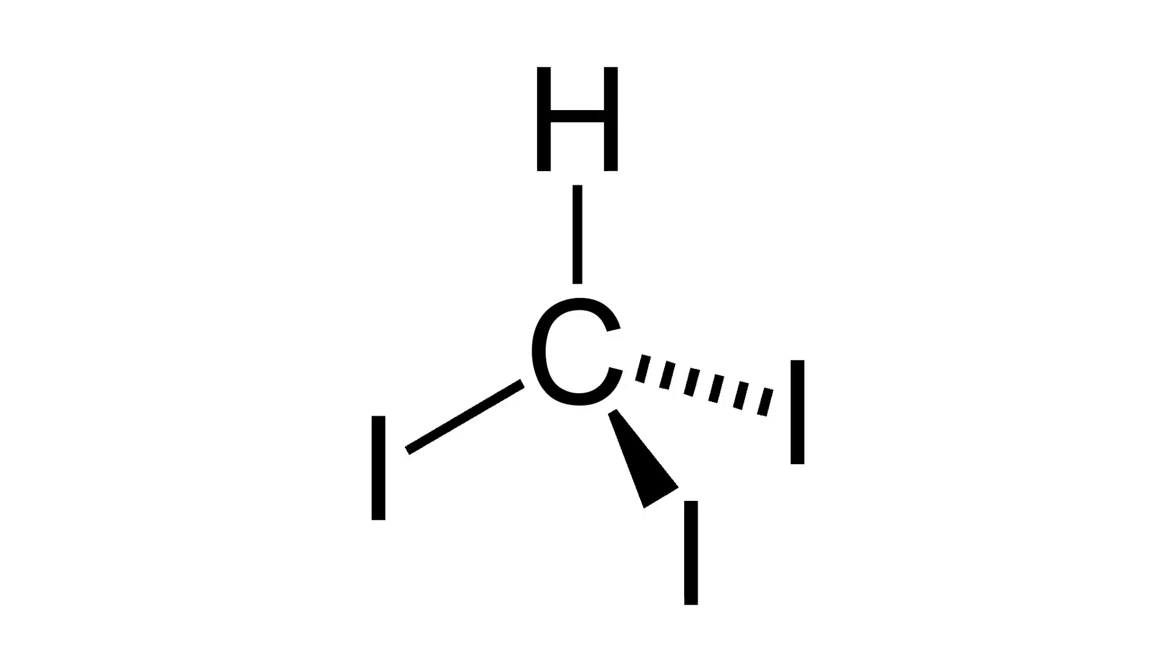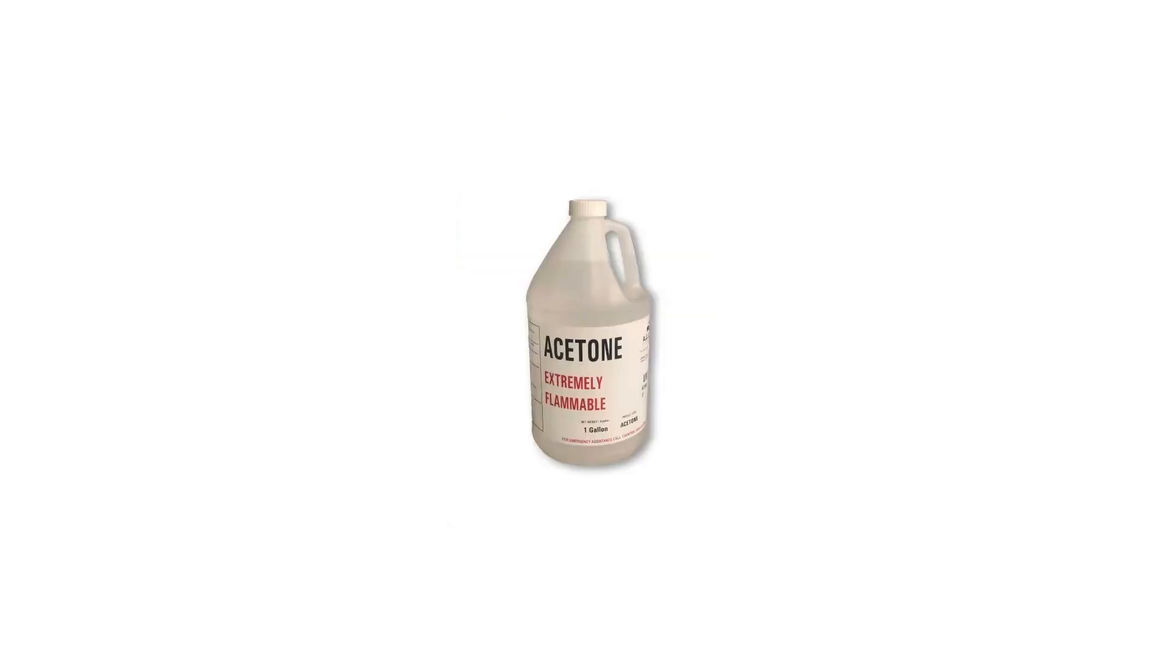Okay, so to synthesize iodoform I will need some elemental iodine, sodium hydroxide, and acetone.